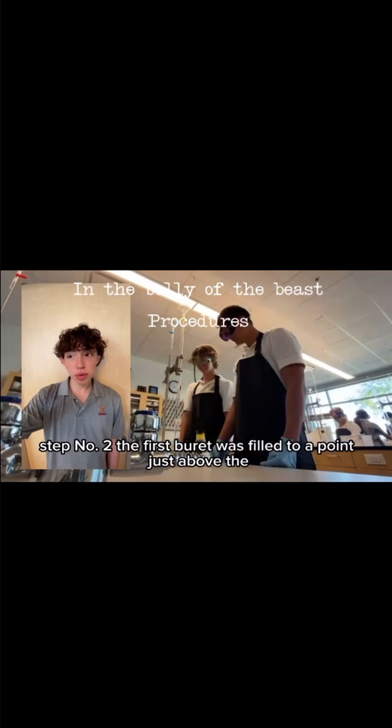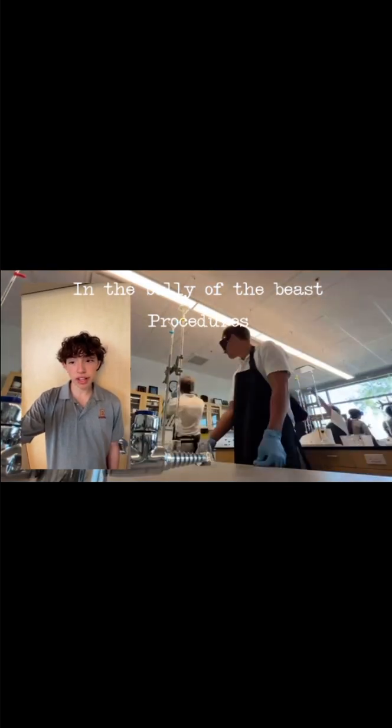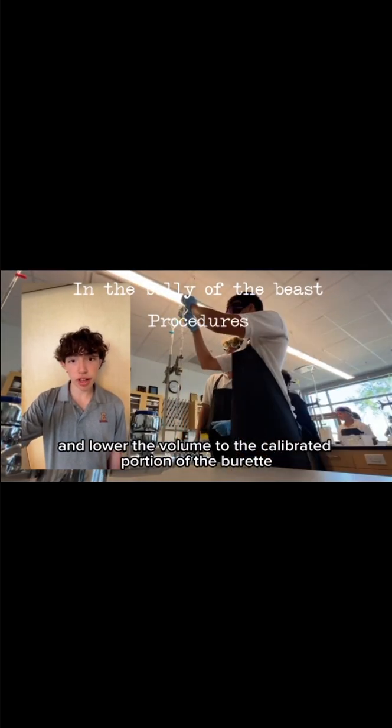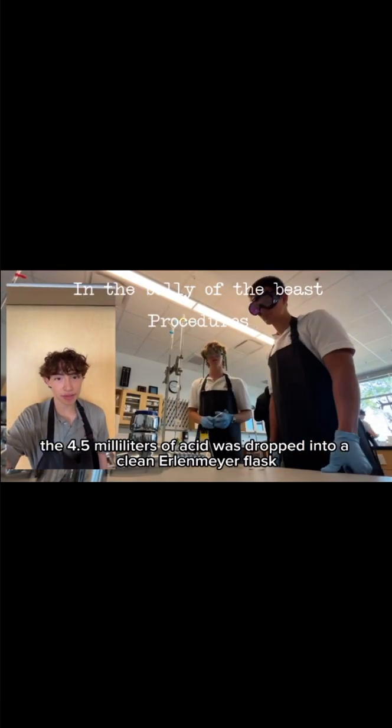Step number 2. The first burette was filled to a point just above the 0 milliliter calibration mark with the acid of unknown concentration. Step number 3. Some acid was released from the burette to remove any air bubbles from the tip and lower the volume to the calibrated portion of the burette.